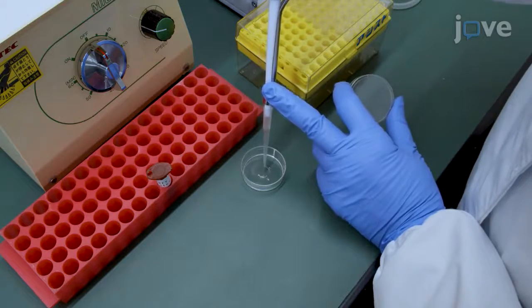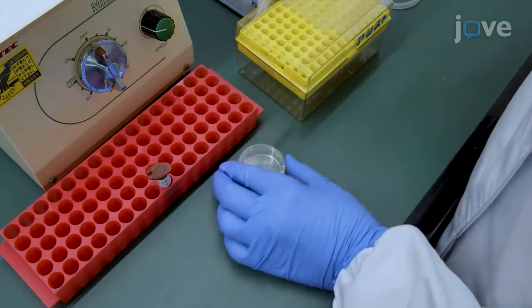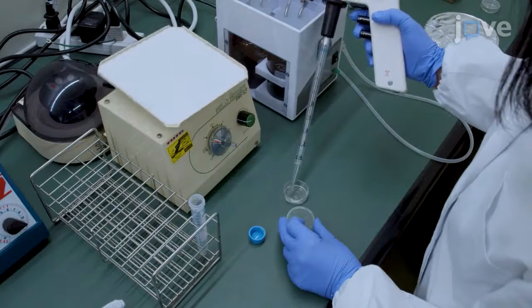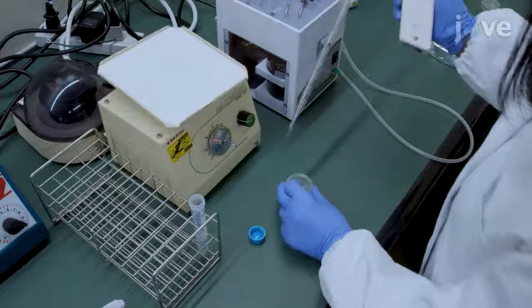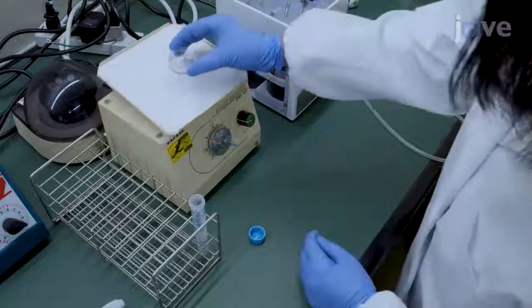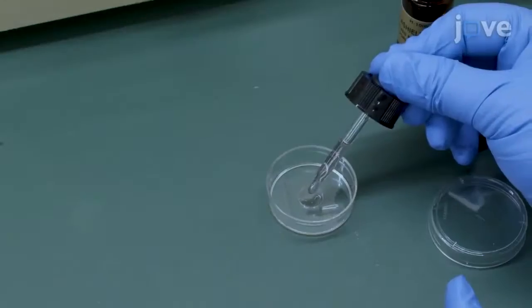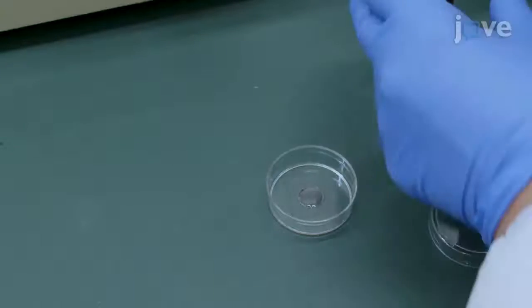To obtain a reference image of crosstalk reference for wide-field microscopy, add 2 milliliters of 0.5 micrograms per milliliter DAPI to stain the DNA. Leave the cells on the rotating platform for 30 minutes. Then replace the solution with 100 microliters of mounting medium.